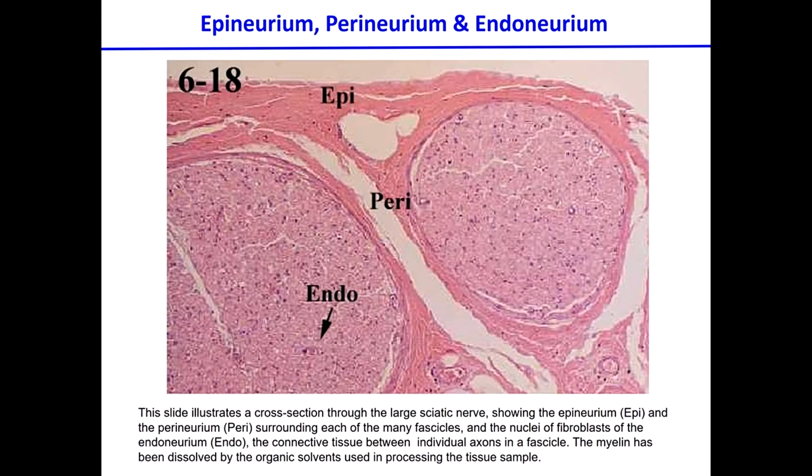Okay, so now this is a better picture compared to the one I showed you in the diagram before. This is the epi, peri and endoneurium. These are the groups of nerve fibers that are forming a huge fiber itself, that then you go to internal fibers, and this is the external portion of the whole thing that should be wrapping around and getting out of the slide. And this is the layer of connective tissue forming the epineurium. Epi means the most external part in there.